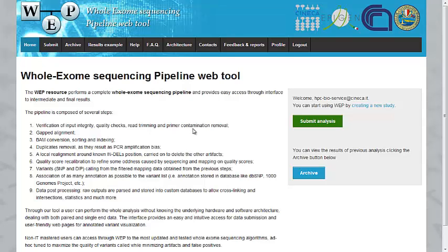Hi! Welcome to our Whole Exome Sequencing Pipeline Web Tool tutorial. In this first tutorial we're going to show you how to upload your files and run an analysis.